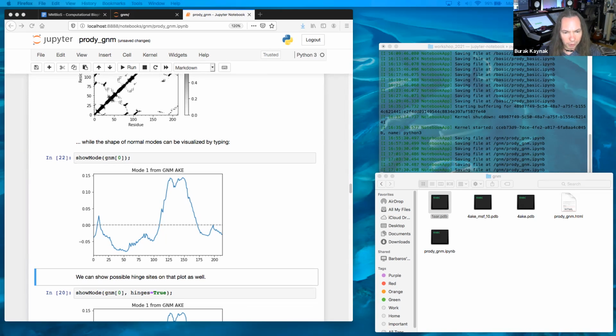And the other question from Johan: do these functions use NumPy or do they use C to diagonalize a Kirchhoff matrix? It specifically uses SciPy, not even NumPy, since in SciPy you can provide more parameters and flags to evaluate the eigenvalues and eigenvectors. And as you know, SciPy is written in C and Fortran.